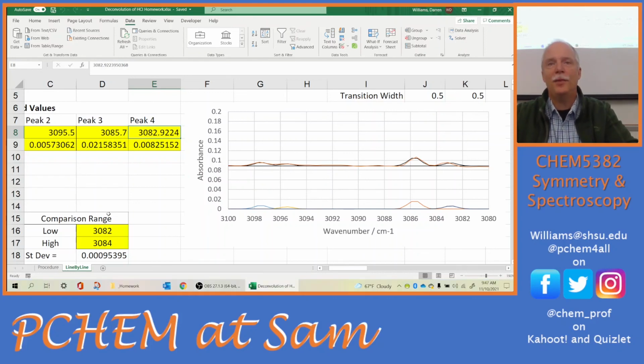Now there are spectroscopic packages like Thermogram, maybe Igor. There are packages that are made for dealing with spectroscopy, not just Excel. Excel is just a spreadsheet, and they will have options for Fourier smoothing, and a percentage of the interferogram that you're deleting. I've done Fourier smoothing up to like 60%, 70%. I'm throwing away 70% of the frequencies in my spectrum, but none of those were my signal. They were all high frequency noise.